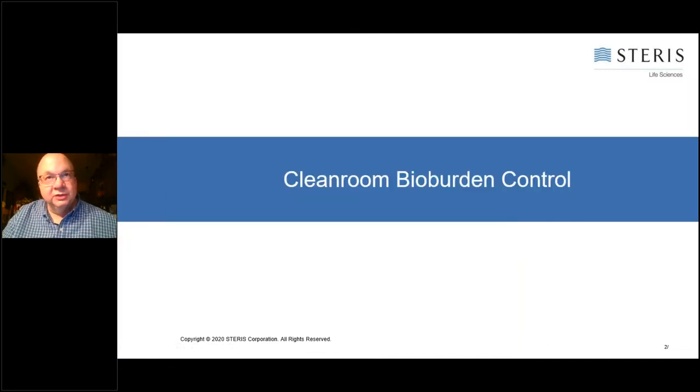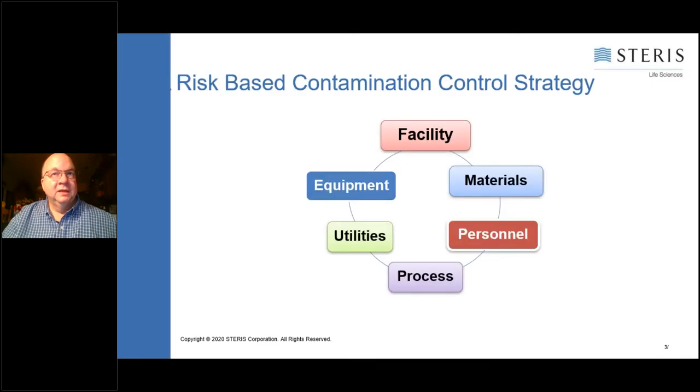So first, let's talk a little bit about the bioburden that we see in clean rooms and where it comes from, and give some case studies and examples of that. We know that the bioburden actually comes from many different sources in your clean room operation. It comes from the aging facilities, things like the ductwork, the sealant on the floor and waxes on the floor. As the flooring ages, you start to get more issues with contamination from that.